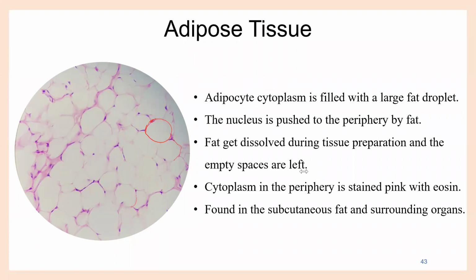Some parts of that may be keratinized. Otherwise, it's the skin. Do we have to find the magnification? Not really. You won't be asked whether it's 40 or 10 or 4, that kind of thing, generally not asked, okay?